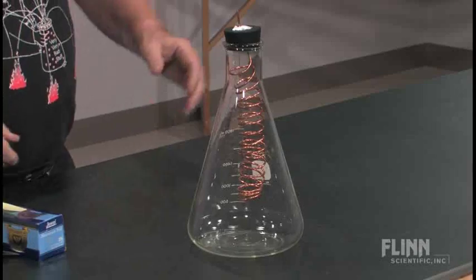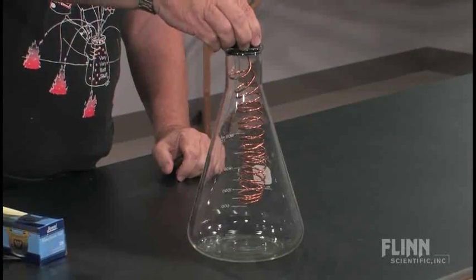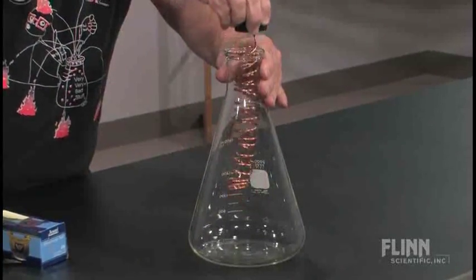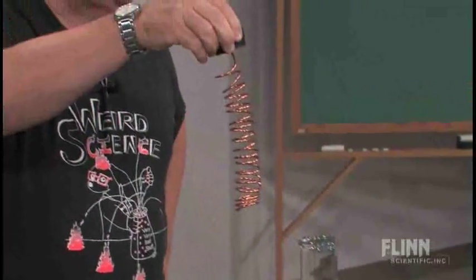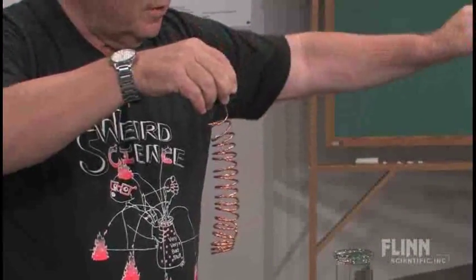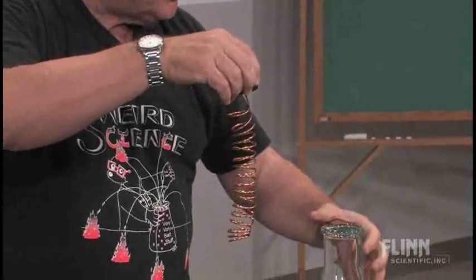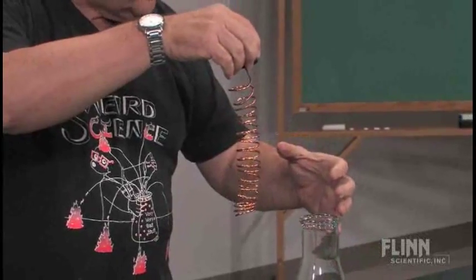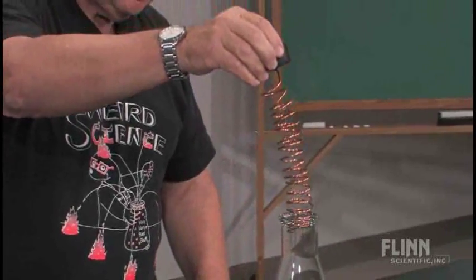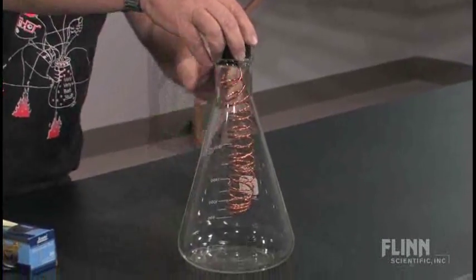What I have here is a clear flask, a rubber stopper, and a copper coil. I used a piece of solid copper electrical wiring and stripped the insulation off to get a coil like this, because I needed some rigidness so I could wind it and get it inside.